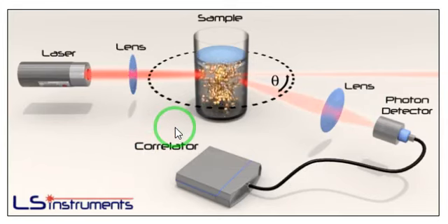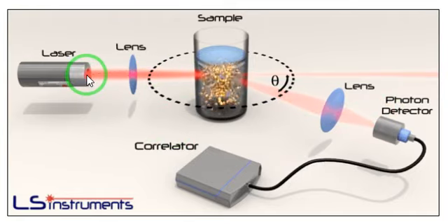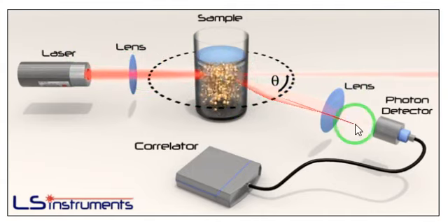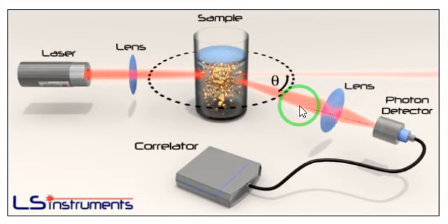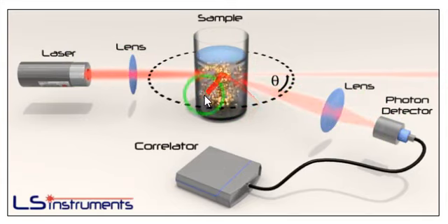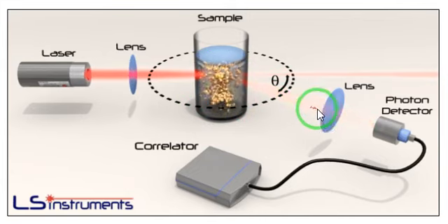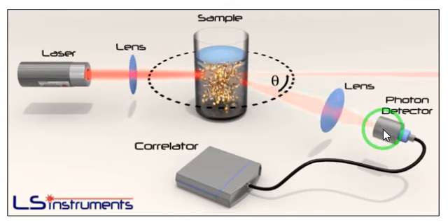Well, now let's get back into our apparatus that we showed you before. We have the light which is shining on our sample. We have the incident light, and now we have here the scattered light which reaches the detector, and you see that based on the movement of these particles, the scattered light, depending on being constructive or destructive, is changing when it reaches the detector here.